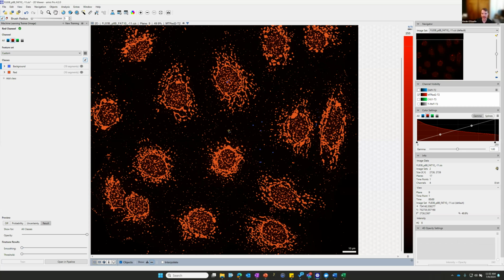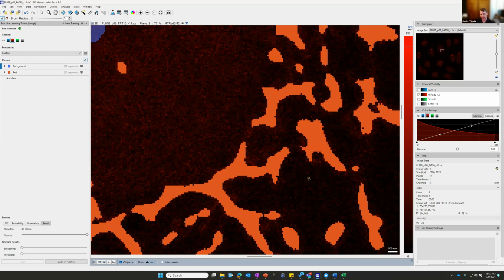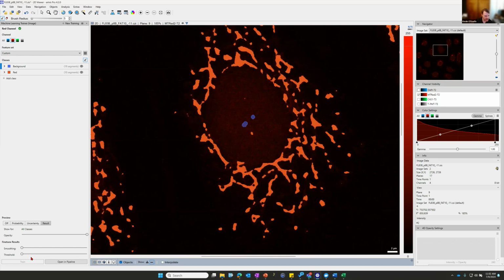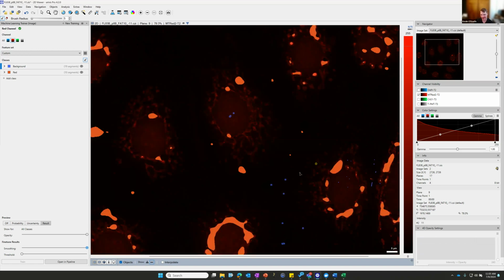It's not actually running the algorithm. So the further I zoom out, the less accurate the preview is going to be. You can see how it kind of looks like it's getting everything right. The closer you zoom in, the more accurate that result is going to be. Just a little FYI. But now if I go and smooth this, it's probably going to look like just a big blob. It's really just getting these cases where they're roundish, smoothing all this information.